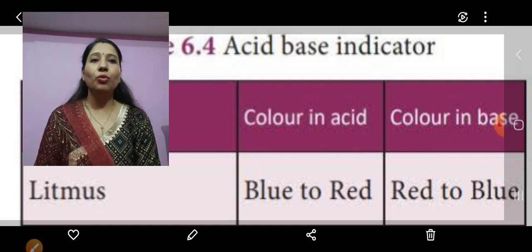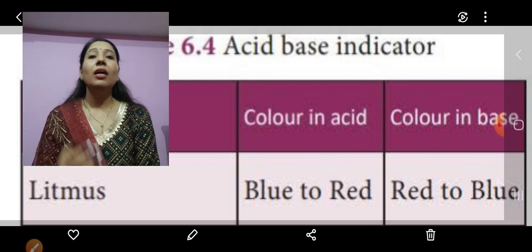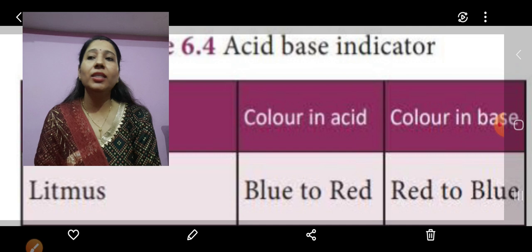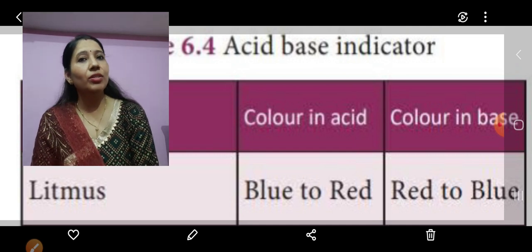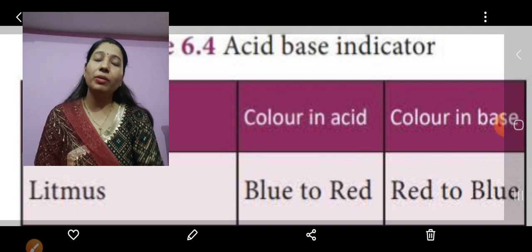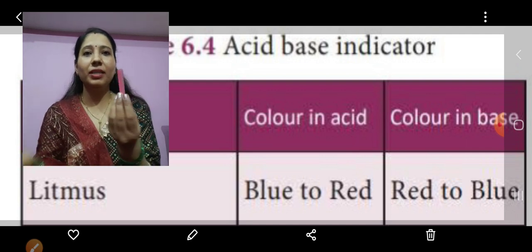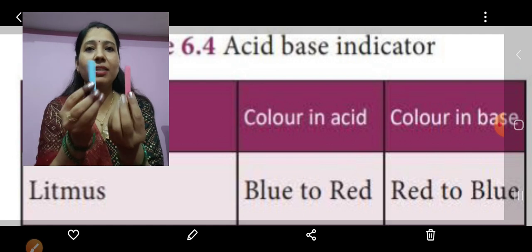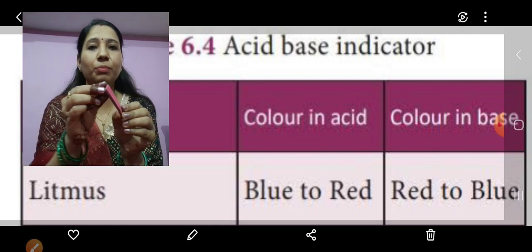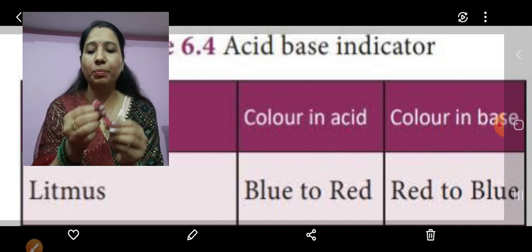Today I am going to show you an activity in which you will see that litmus paper is used as an indicator to test whether a given solution is an acid or a base. Do you remember what the litmus paper is made from? I will show you. Here I have a red litmus paper and this is a blue litmus paper — a whole lot of strips. We will take one strip and perform an activity.